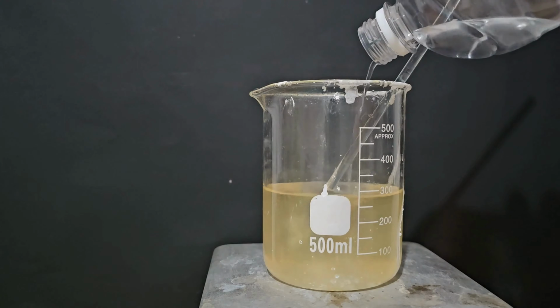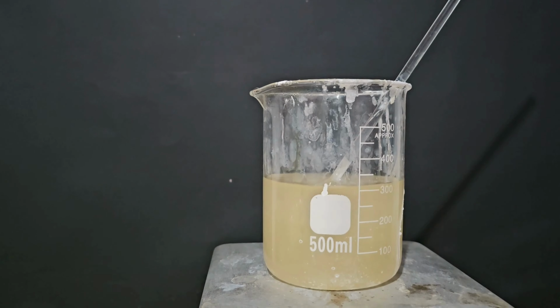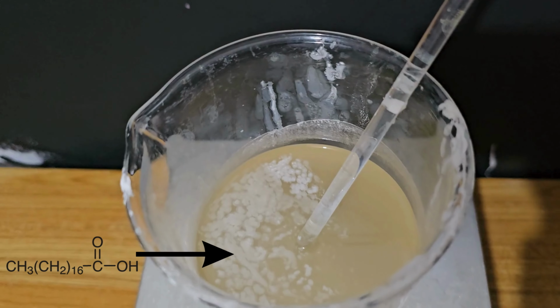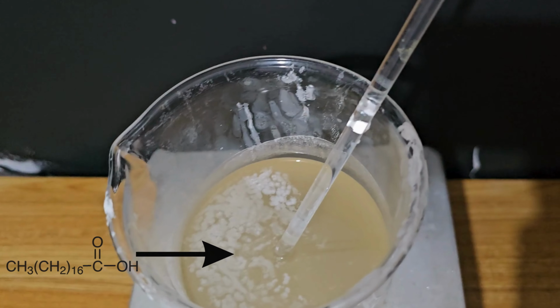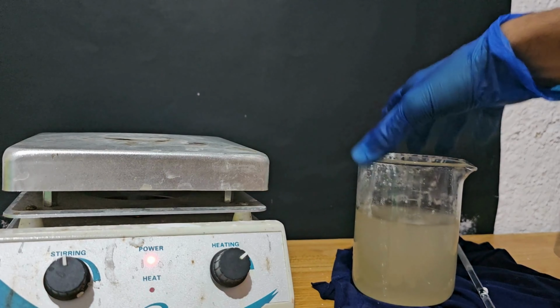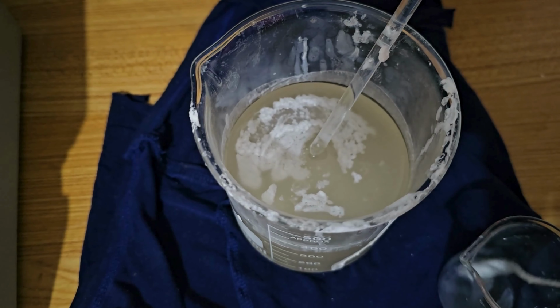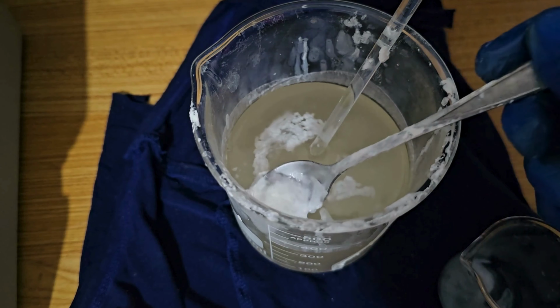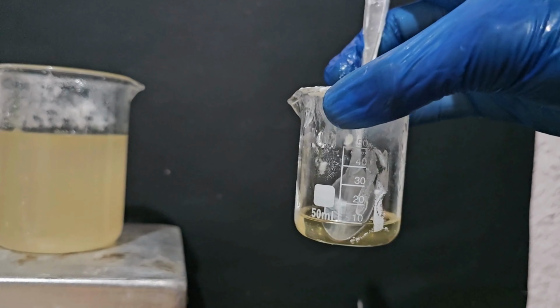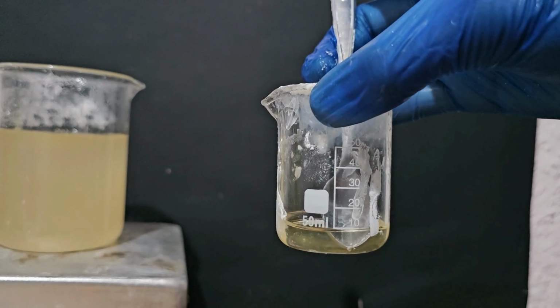When everything had dissolved, I started adding water until the stearic acid crashed out. That's because the capsules also contain stearic acid, and it is extracted along with para-aminobenzoic acid. I took the beaker off the hot plate and manually removed all the stearic acid that started crystallizing on the surface. I dissolved the stearic acid in acetone, as you can see it is quite soluble.